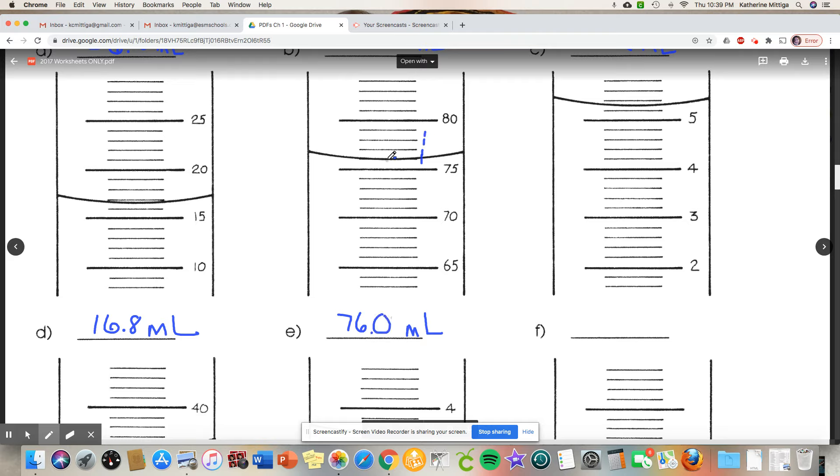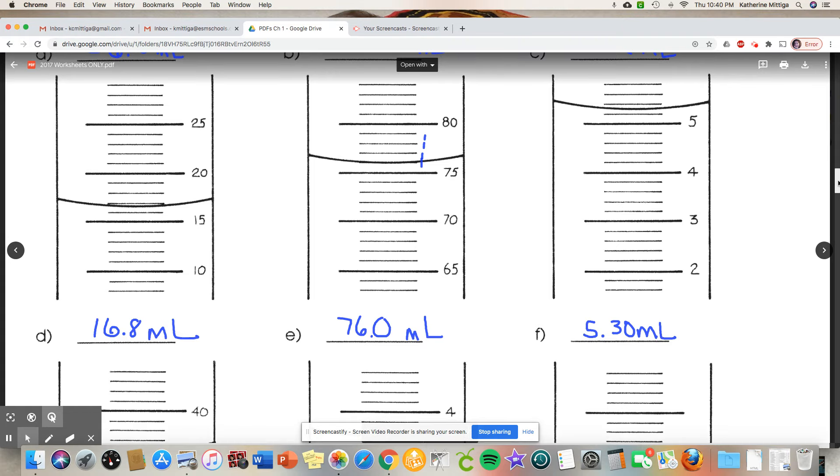Notice with this one, this looks like it's to the point twos. So if we know that first decimal place, which is the tenths place, we can go to the hundredths. So here's five, five point two, five point four. So in between five point two and five point four we're gonna go five point three.